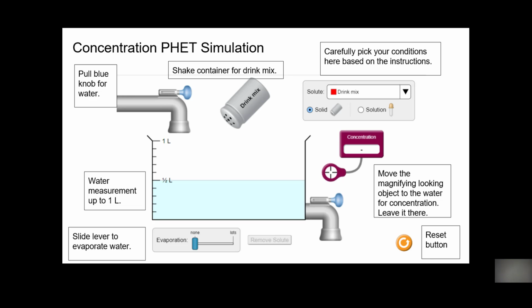Now we're going to get to the lab portion. So not only are you going to graph, you're going to have to do some things before you can graph. You have to get some values, and you're going to do some experiments. LabFlow is going to take you to another website, and this is a free website.